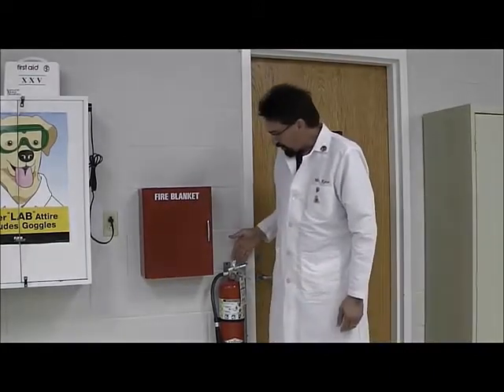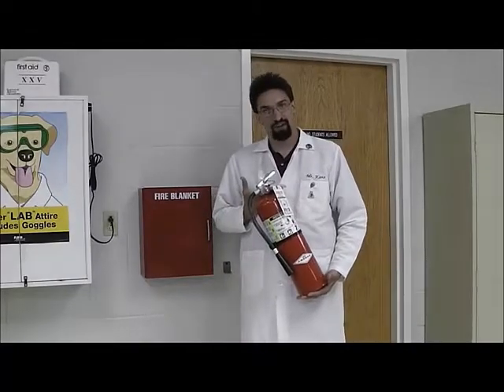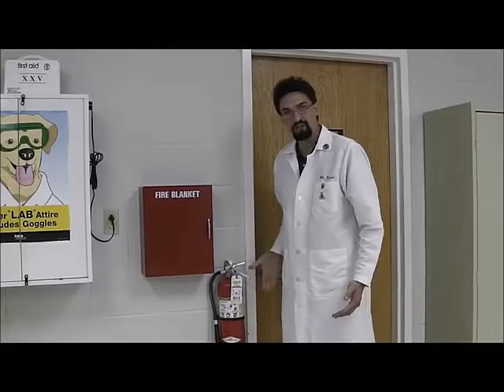Hi, I am Mr. King. You can see that we are sitting here right next to the chemical storage room. What I want to show you first is the fire extinguisher. You can see that it hangs right on the wall, and it is not attached to the wall in any permanent way.